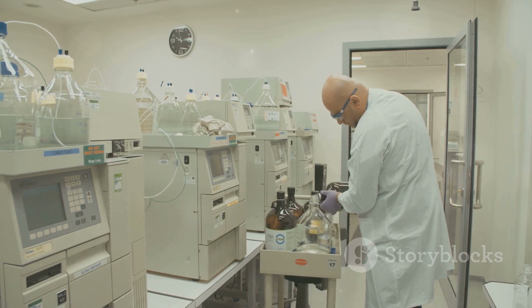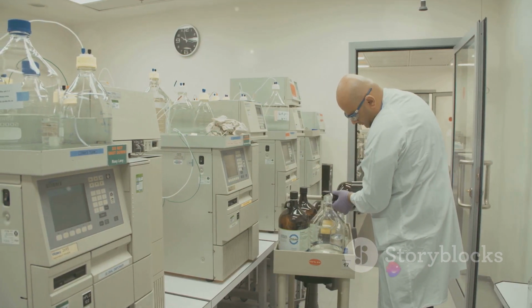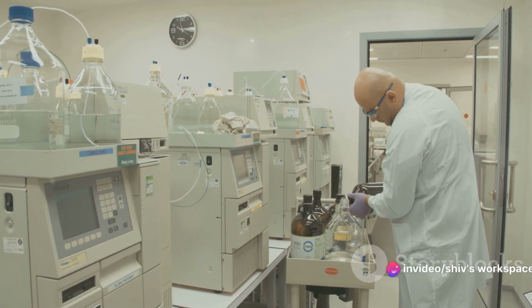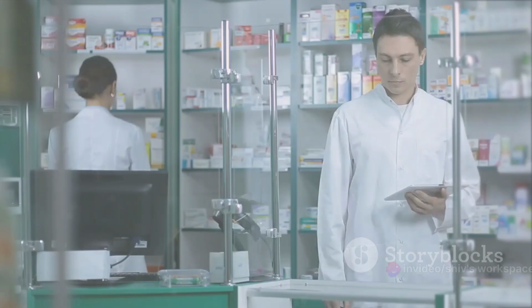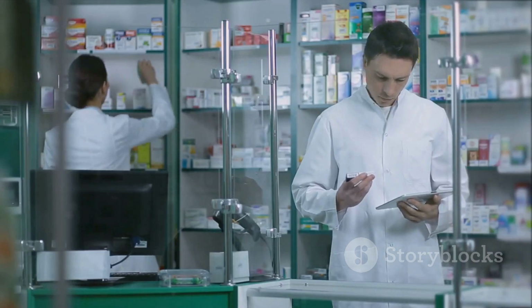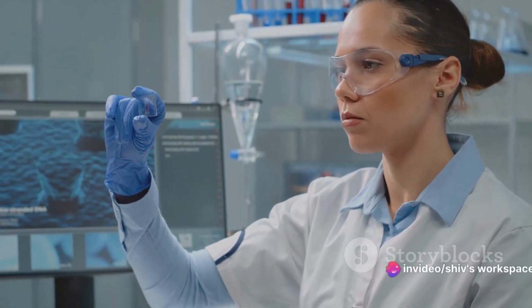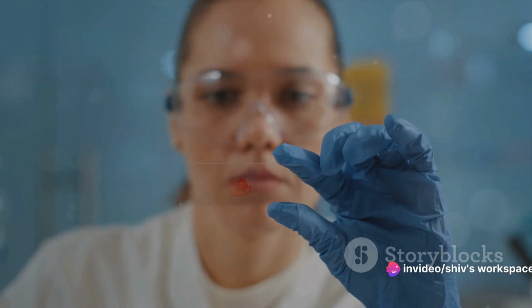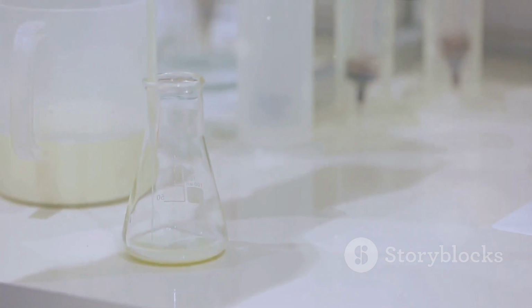The detector's job is to identify and quantify the compounds as they elute from the column. The data from the detector is then sent to a computer for analysis. High-performance liquid chromatography is used in various fields. In pharmaceuticals, it's used to analyze the purity and content of drugs. In environmental testing, it helps identify pollutants in samples of air and water. In forensics, it can detect drugs or toxins in biological samples. The food industry uses it to quality check products for additives or contaminants.